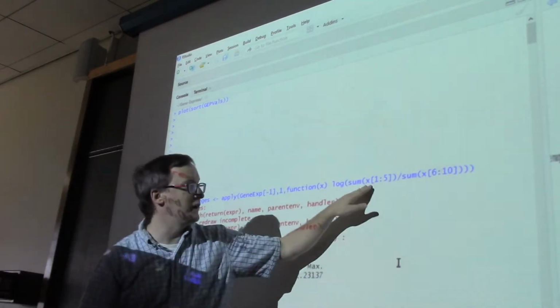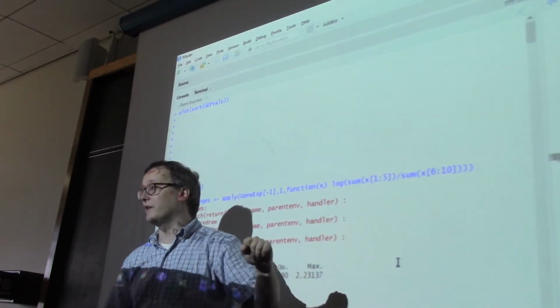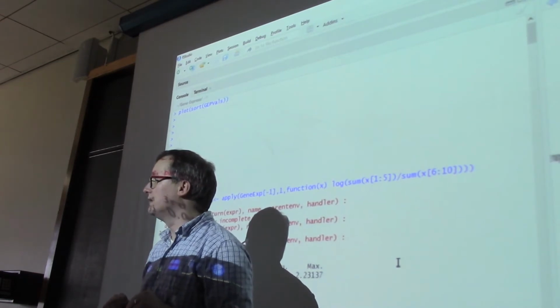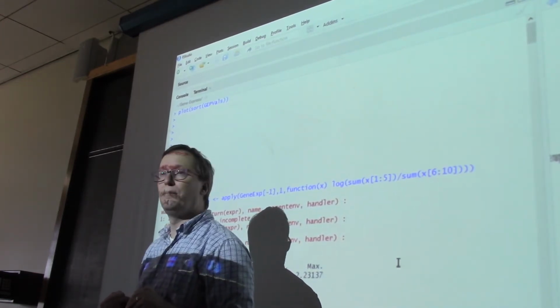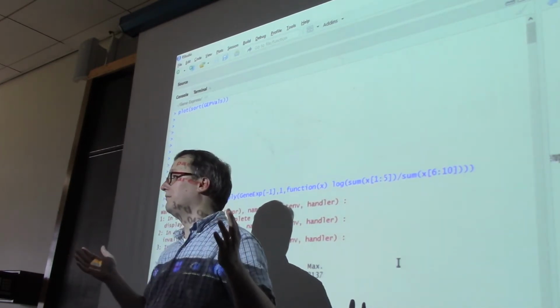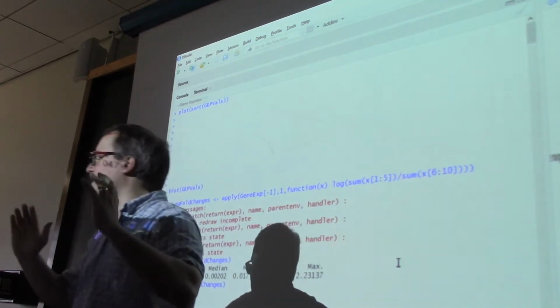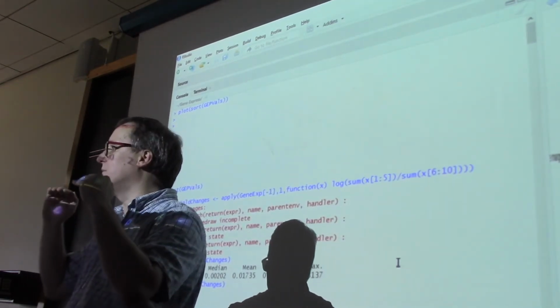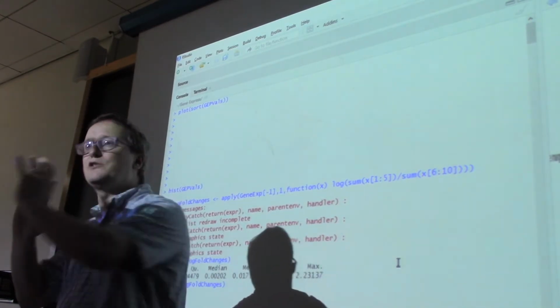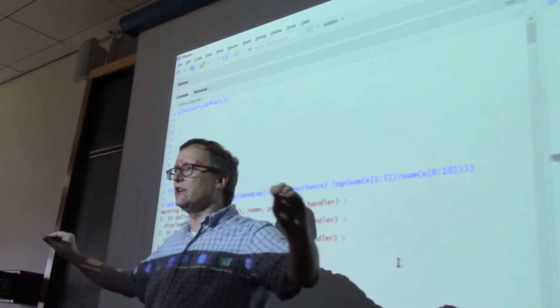We already said that if the reds were twice as intense as the yellows, this evaluates to 2, and then I take the log of it. But what does it come to if the yellows are twice as big as the reds? 1/2. So 1/2. It means that if I have some genes that are much higher in the yellows than they are in the reds, I would get values that are closer and closer to 0. But instead, I want these to spread out nice and evenly along a number line.